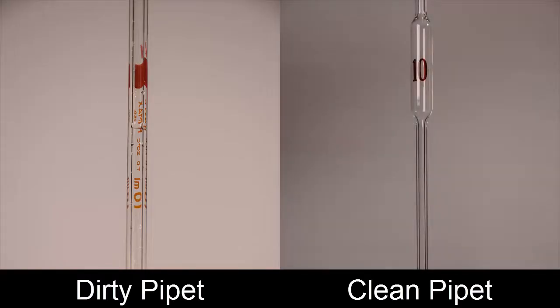Before use, rinse your pipette with distilled water to verify whether it is clean. Cleanliness is indicated by the presence of an unbroken film of distilled water coating the inside of the surface when the pipette is drained. A dirty pipette will have droplets on the inside surface.